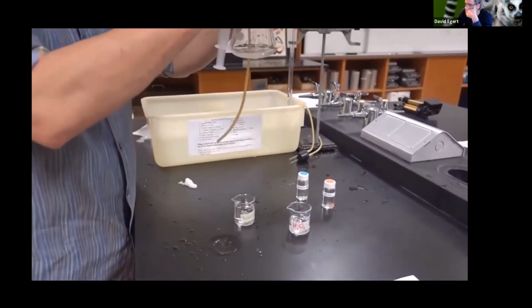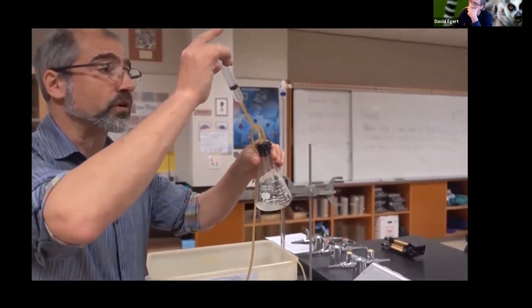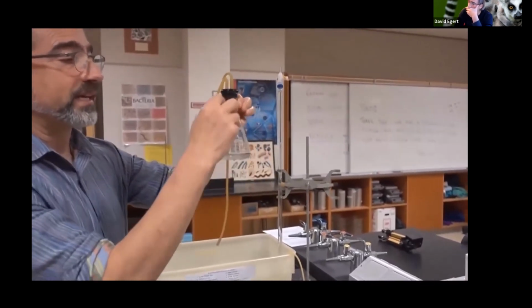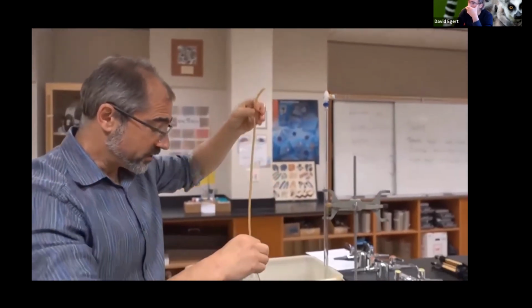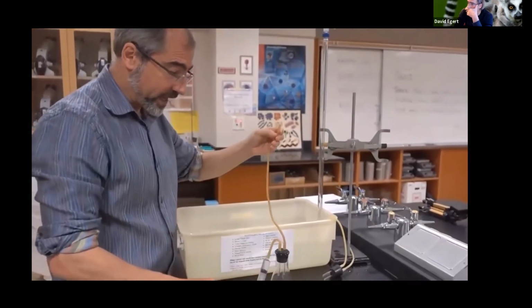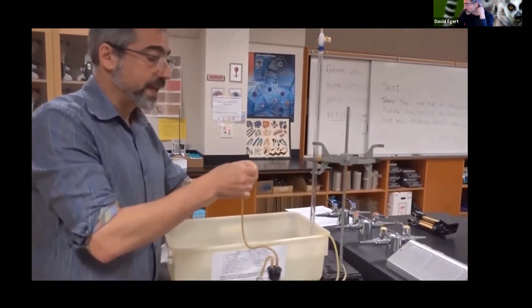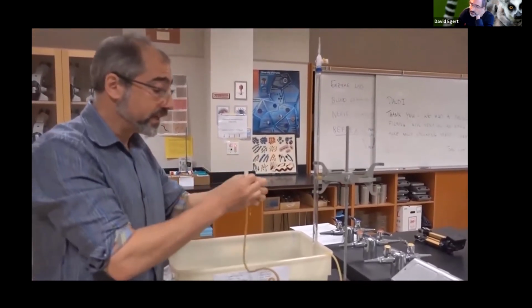So now we're kind of set here. When I want the experiment to start, I just squirt the substrate into the enzyme. The reaction will happen. Any gas, oxygen that gets produced will exit through this hose. So this hose now is going to have to be placed in the burette where I can actually capture and measure the amount of oxygen that's getting created.